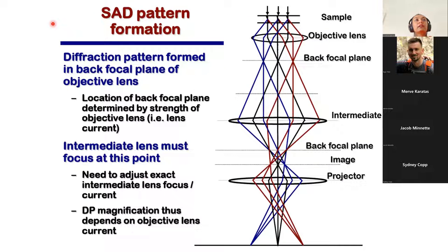Now, we are here. I think we talked about it, but this is again very important for today. So we recall this from our previous classes where we talked about selected area diffraction pattern formation. This is a recall. When you get a diffraction pattern of a certain magnification on your sample, you can play with the diffraction pattern. And it is an important step because it helps in measuring different quantities you can measure through it by playing with a diffraction pattern.